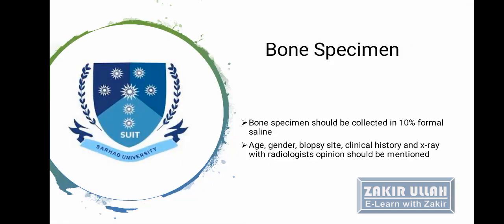Bone specimens should also be collected in 10% formal saline. The information which should follow the specimen includes the age of the patient, the gender, the biopsy site, and the clinical history of the patient, along with the X-ray or other radiological investigations. The radiologist's opinion is a must regarding the bone specimen.